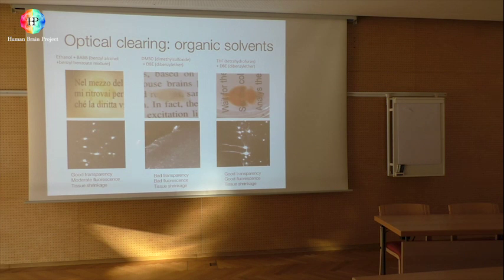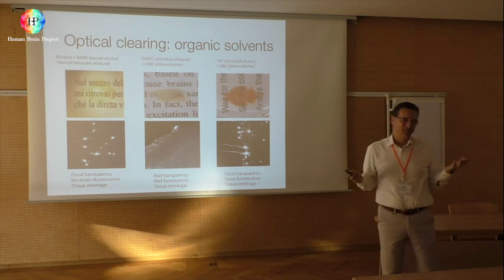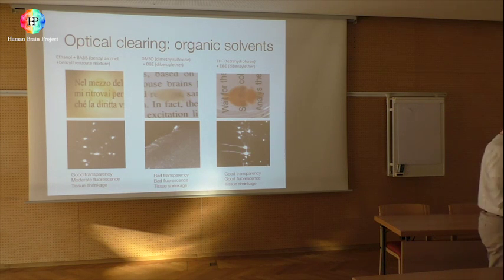The disadvantage is they all create tissue shrinkage. So the brain is reduced by a factor of 2, and that's bad. Or it is increased by a factor of 5, and this is nice. But I'm joking, it's bad in all cases because you want to preserve the shape of the brain.